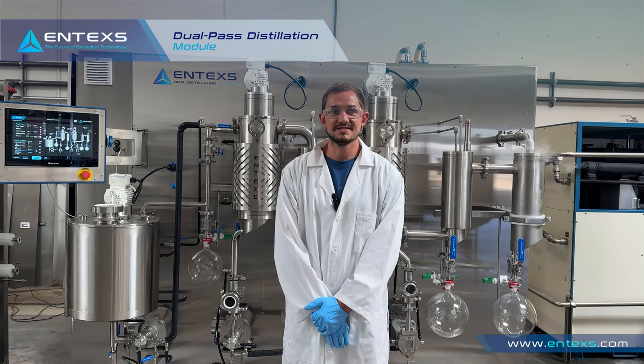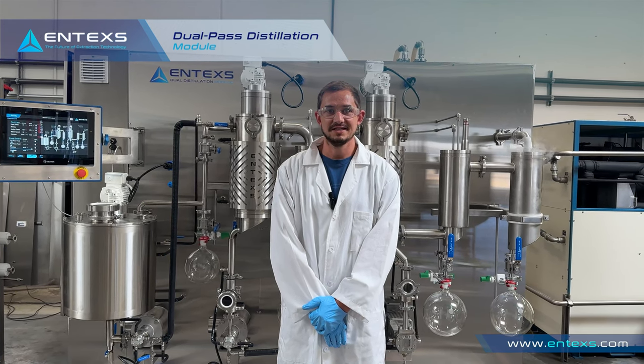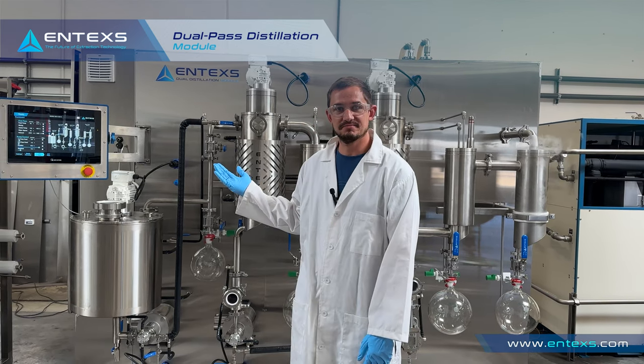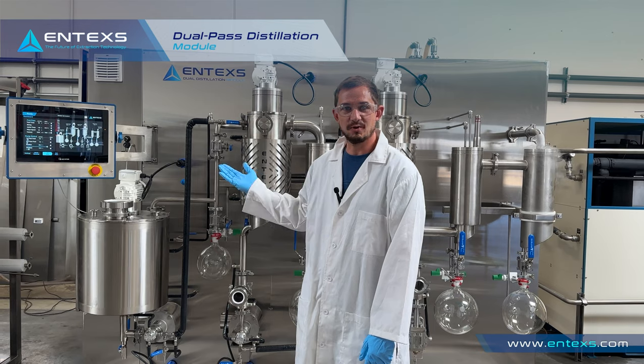My name is Daniel Blackburn. I'm a senior chemist here at NTEX and today we're going to be going over the dual distillation system, the operation principles, and how to run it.